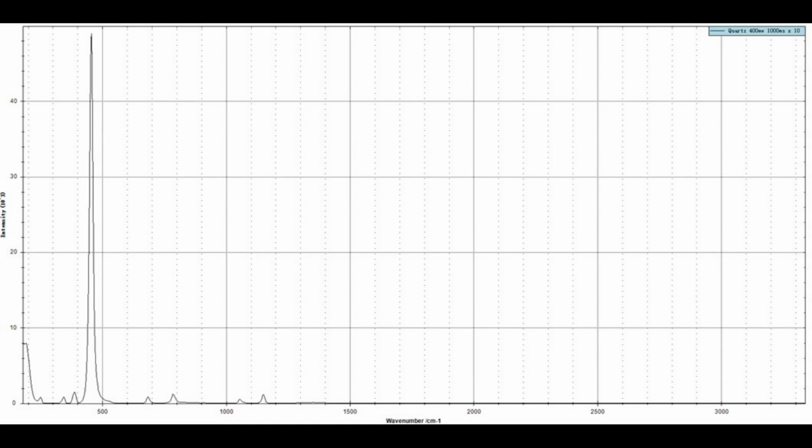Finally, if we repeat these last few steps of having to tune the wheels, so coming closer or farther from the sample, and taking a dark spectrum, then taking a single acquisition or continuous acquisition, you can try to optimize the signal and you can obtain this kind of signal.